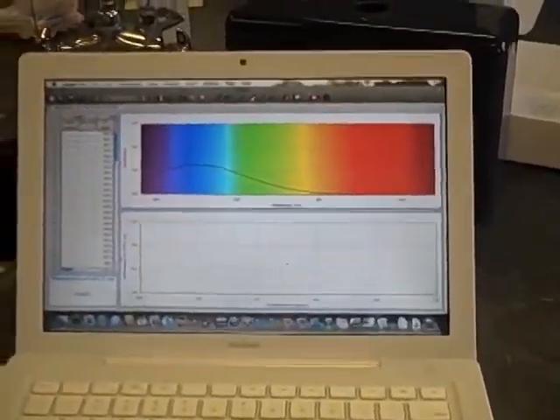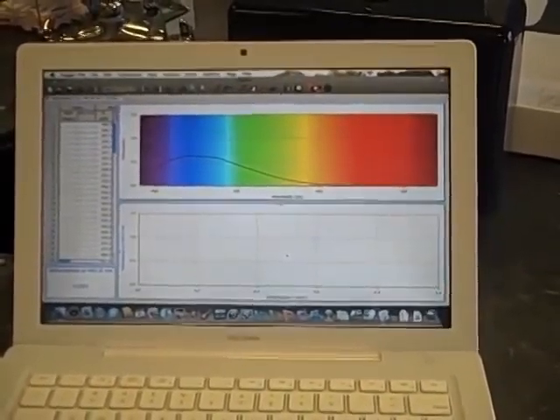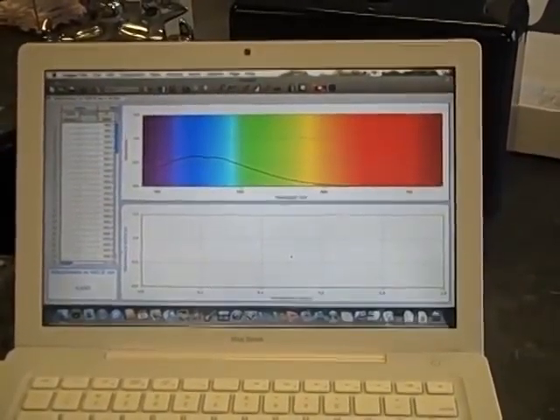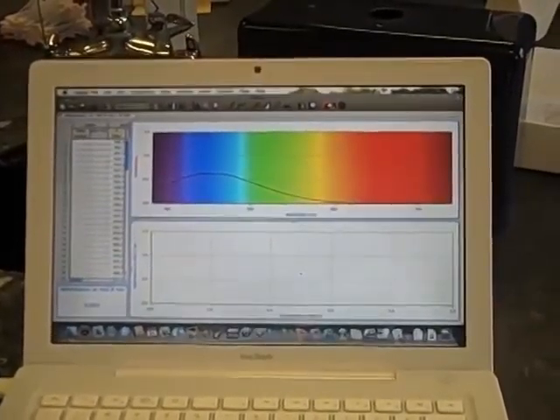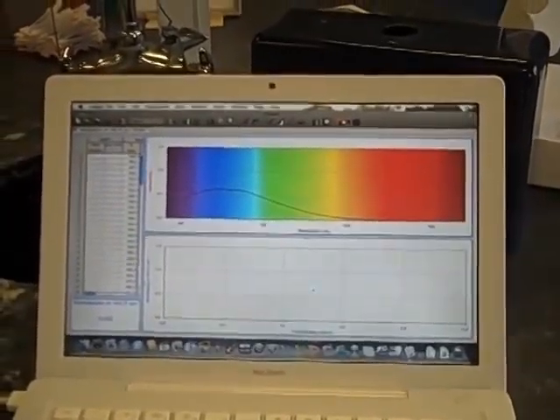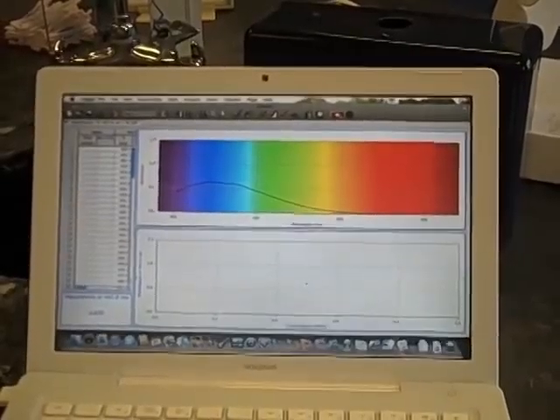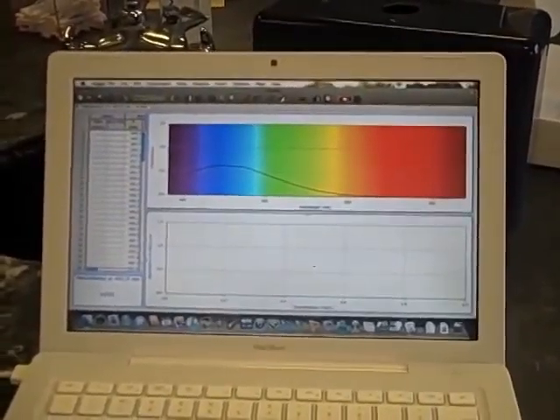Okay. And so did you kind of watch it until you see it stabilize? Yeah, and sometimes it won't look like it's stable, it'll keep changing, but it'll only be between 2 or 3 numbers. Oh, kind of like what it's doing now. Yeah. 0.634, 0.633, 0.632. It's stabilizing pretty fast. So I think this one's stable.